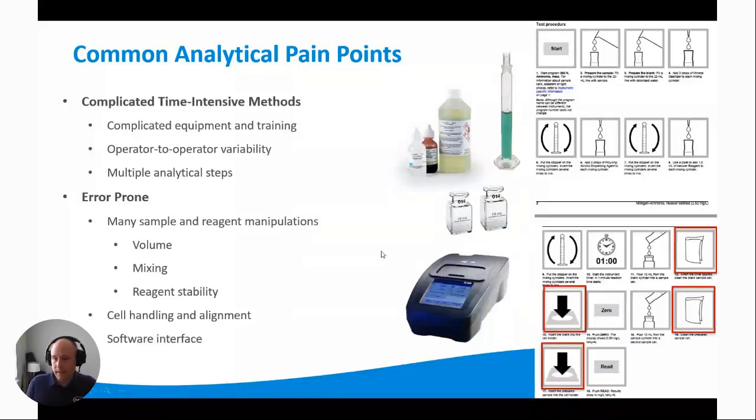After that, we also have cell handling and alignment issues. Spectrophotometry is an optical method where we shine light through one of these cells here, and you'll notice on these cells, these both say 014 on them. These are optically matching cells, so that you can run the blank in one and the sample in another, and you know that the way that the light interacts with the glass will be the same for both of those, and you won't get a different absorbance value just as a function of the glass itself.